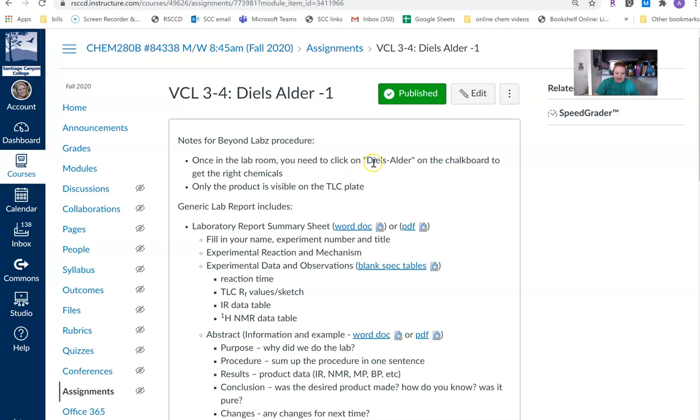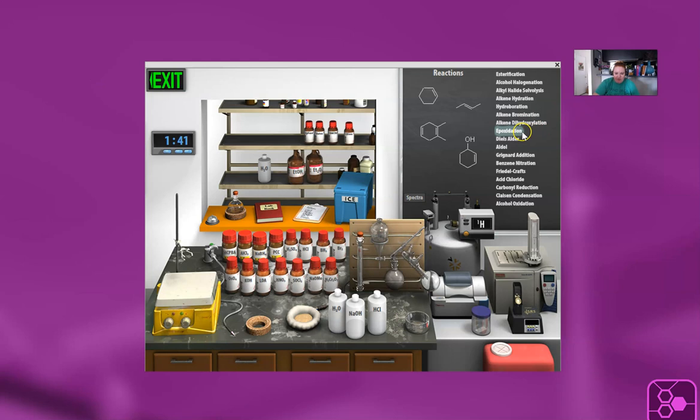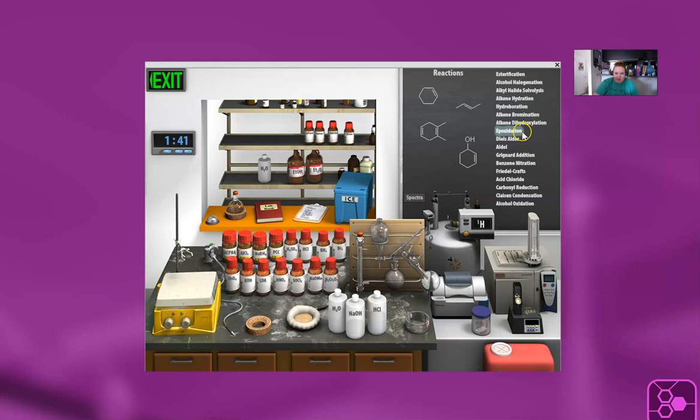And on Canvas, in the notes section, it says once in the lab room, you need to click on Diels-Alder on the chalkboard to get the right chemicals. For some reason, there's a bit of an error in the software just with this experiment, and it opens it up to the epoxidation section. So I'm going to click on Diels-Alder.